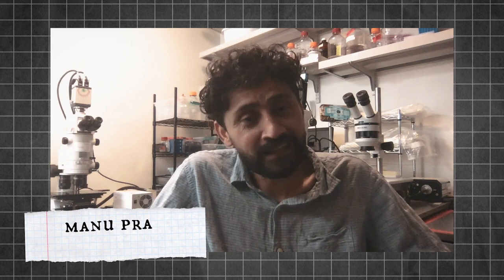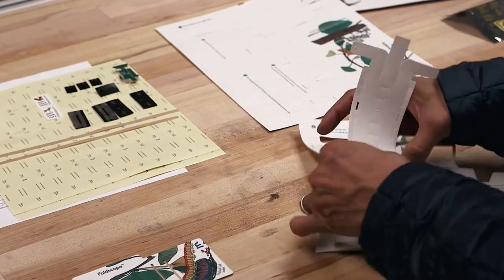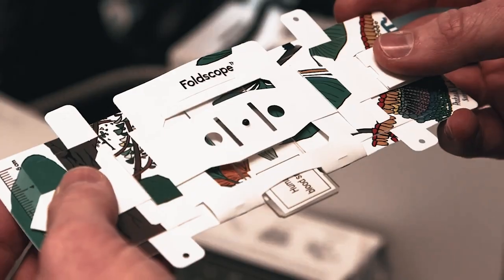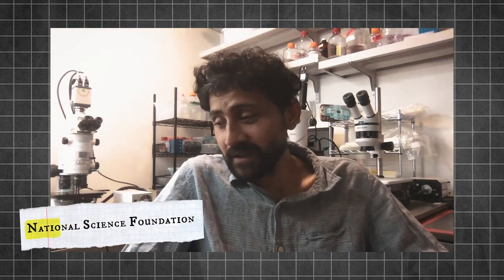People found that silly, primarily because I said the right way to manufacture microscopes is out of paper. And that by itself was laughable. That was the grant that I wrote to the NSF. I was finally surprised that we were supported to pursue this idea of what I called print and fold optical instruments.